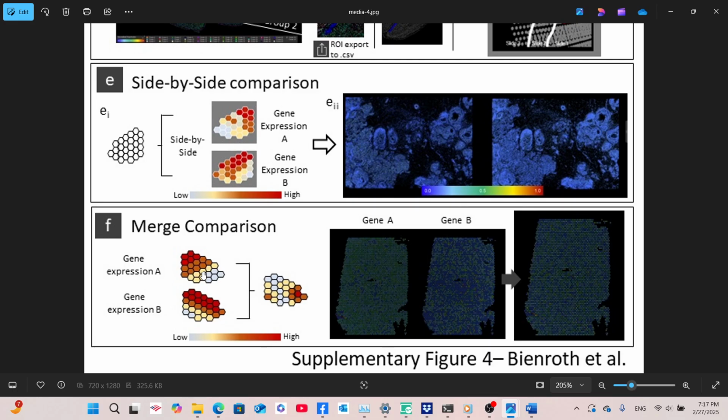This creates a comparison of gene expression within the tissue section. Areas with more similar expression between the two genes will be displayed in cool colors, with areas of difference in warm colors, displayed here with the Visium human lymph node.